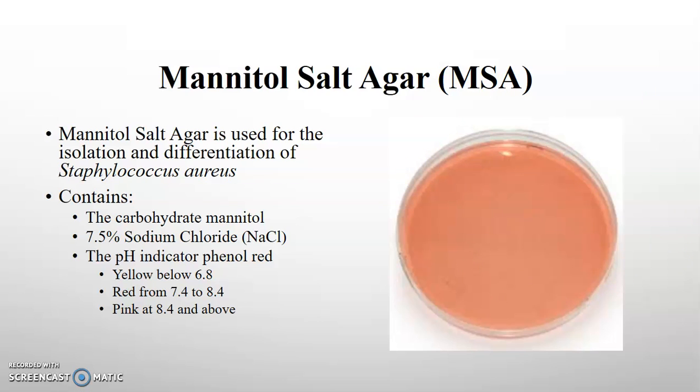So over here, we're looking at just kind of an empty mannitol salt agar plate, and typically we would inoculate that with our bacteria and then look to see if it grew or not, and then also look to see, if it grew, what color did it grow.